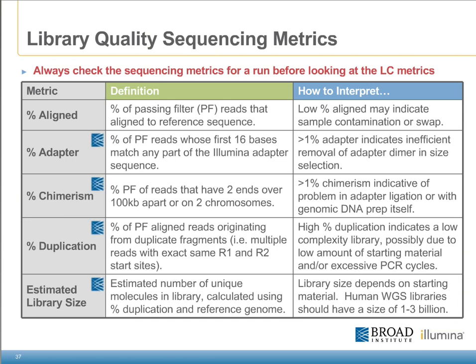If these samples were whole genome amplified or had some other processing, there could have been some weird structural rearrangements that were artificially introduced. Percent duplication and estimated library size I talked about earlier when we were talking about PCR, but these are an indication of how duplicated your library is. Percent duplication is when read 1 and read 2 for two different clusters have the exact same start sites and end sites. So basically, it is the same molecule.